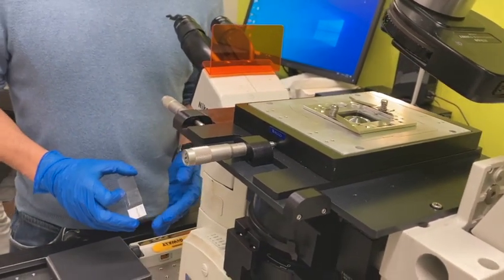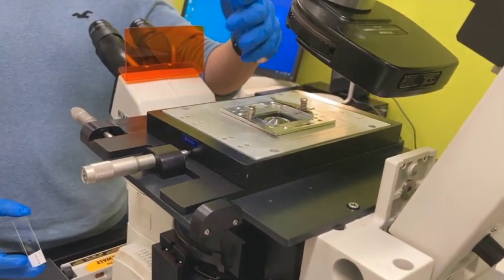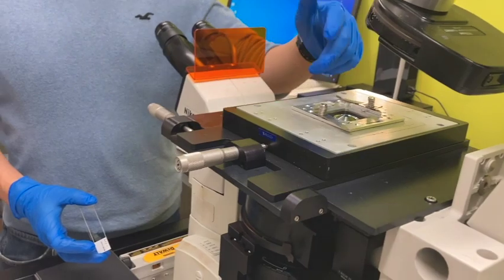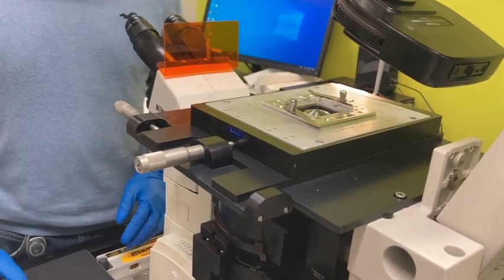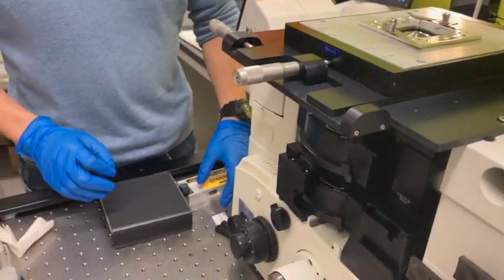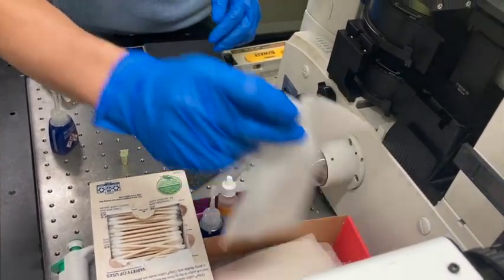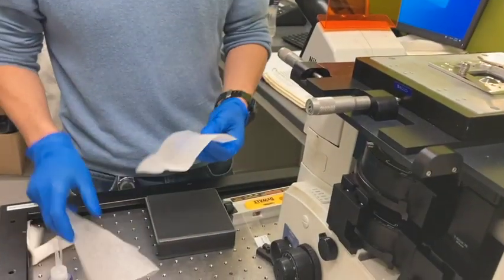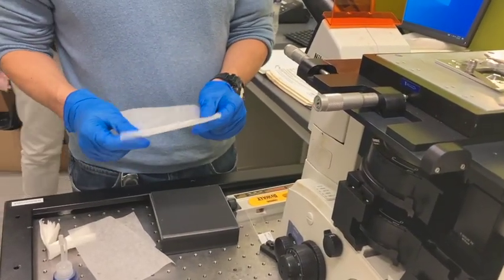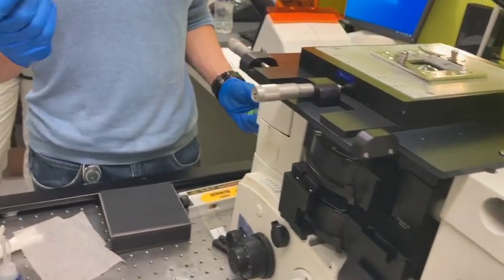I don't want to say that, but generally it's safe to remove any oil or dirt on the objective. But practically, you need to do it as gently as possible. That's recommended by Thorlabs. I never do that, but just to say that's the right way to do it.